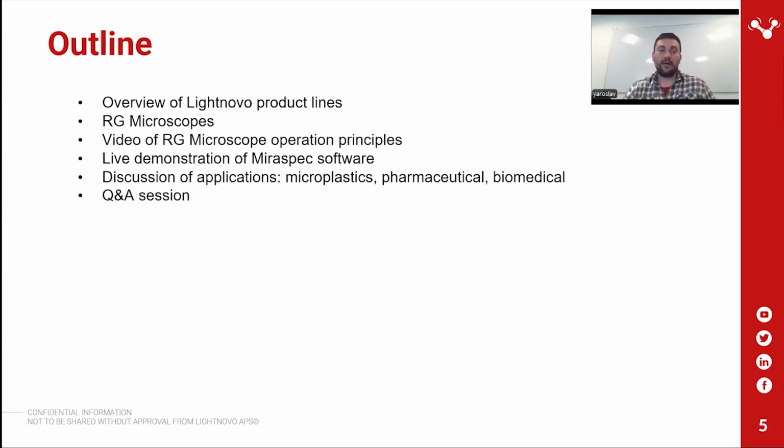Here's an outline of this webinar. In the beginning, I already gave some introduction, but I'll give an overview of our product lines. Then I'll show some slides about RG microscopes. Then I will broadcast a video of RG microscope operation principles from our lab. Then I will do a live demonstration of MiraSpec software with some examples of applications: data analysis in MiraSpec software, microplastics, pharmaceutical applications, biomedical applications. After that, there will be a brief question and answer session of about 10 minutes. Please, if you have questions, type them in the chat during my presentation, and I'll try to answer them in the end.